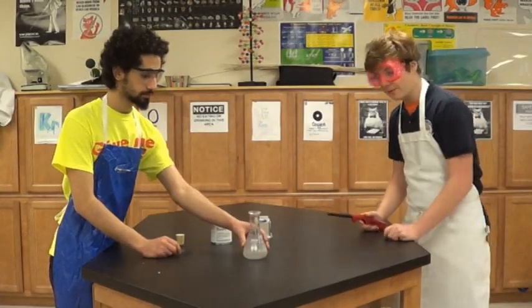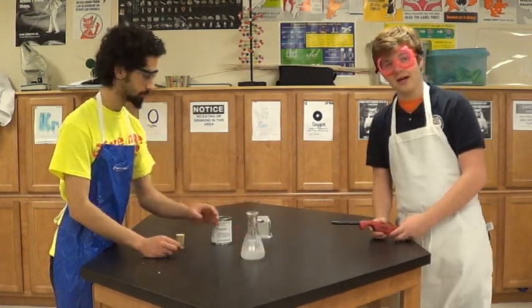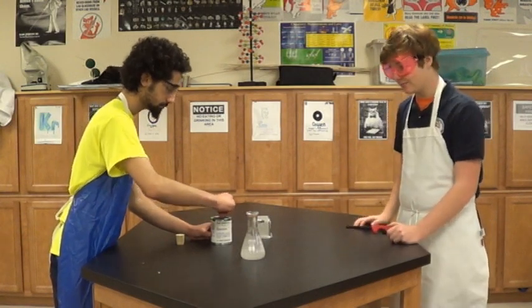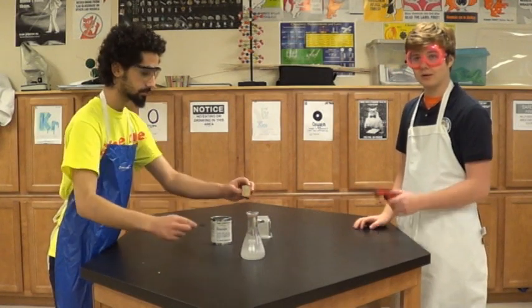So, the first thing we did is we put about 100 milliliters of water into this flask. Next, we're going to add some calcium carbide, which reacts with water to create acetylene gas, which is highly combustible. Then, we will light it and shoot a cork to the ceiling.